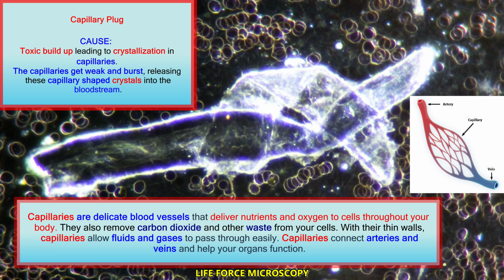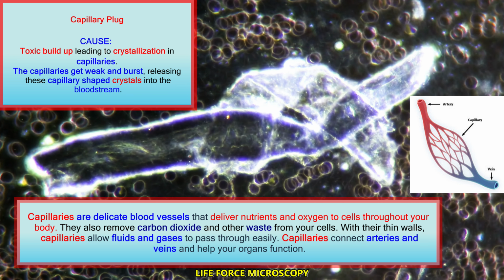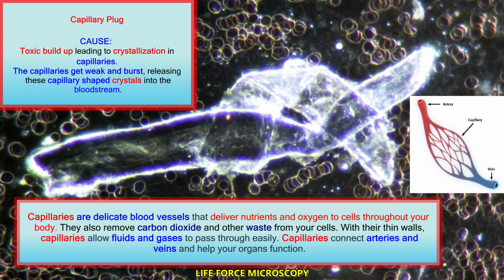A capillary plug is a toxic buildup leading to crystallization in capillaries. In other words, the capillaries get weak and burst, releasing these capillary-shaped crystals into the bloodstream.